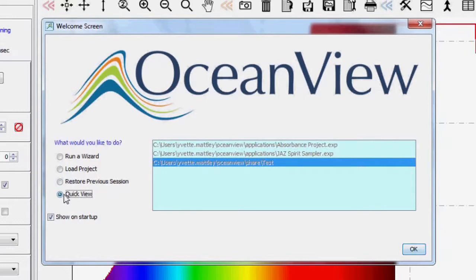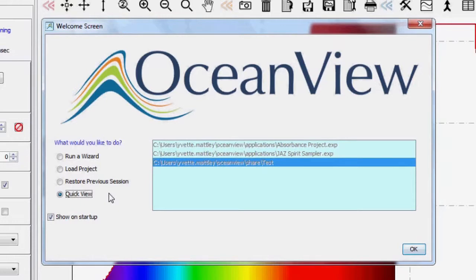Finally, select Quick View to go into a raw, unprocessed acquisition mode where you can make some quick assessments of your setup and determine the optimal acquisition parameters for your measurements.